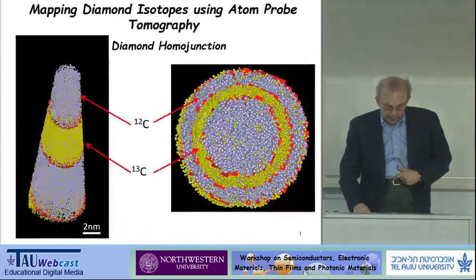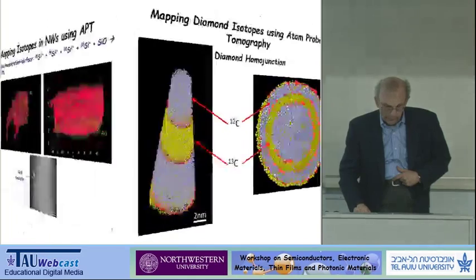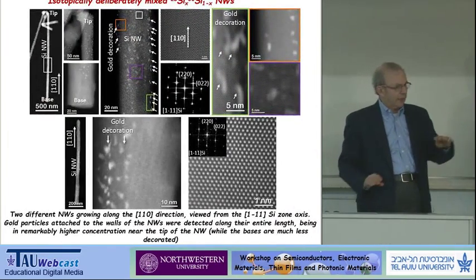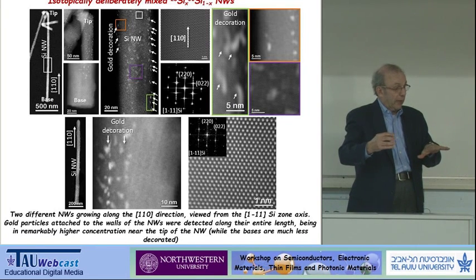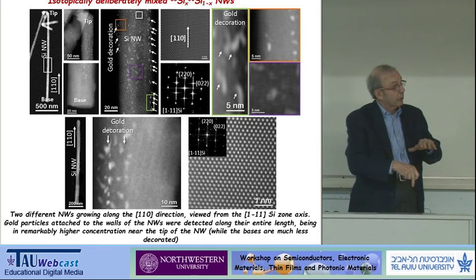You asked about combining it with TEM. It's another transfer step. So you take a TEM grid, and it's one where they're numbered or lettered A, B, C, and then you can take a nanomanipulator and attach the nanowire to these pieces of copper on the grid, and then you can put it in an electron microscope and look at them.